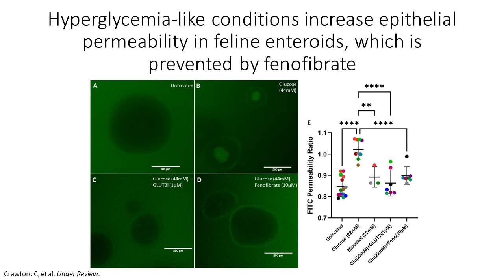And in each culture condition, we have dozens of those organoids. So each data point that you see here is an average of an experiment. We've done that a lot of times. So Kiki spent lots of time measuring the fluorescent intensity around all of those organoids.